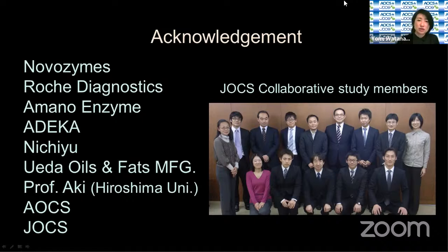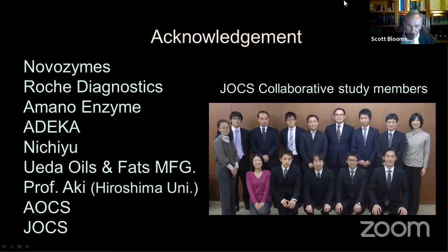For this, one possibility is to increase the enzyme amount. But we also have a risk of promoting the acyl migration from the 2 position to 1,3. So we have to investigate, of course, to refine the procedure. Yes, thank you for the suggestion. I always think about it. It's a very tricky balance with the acyl migration. Right, exactly.